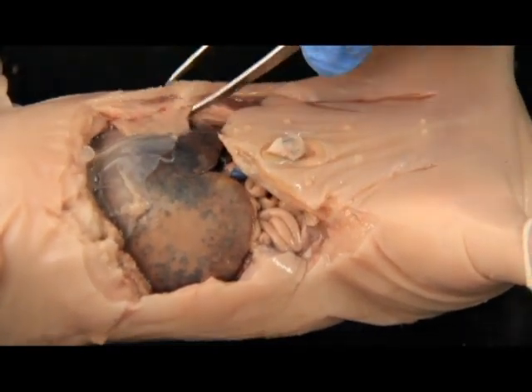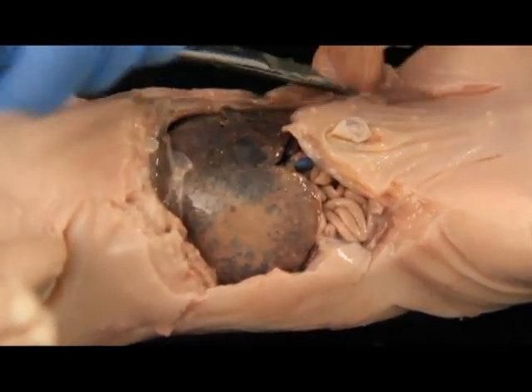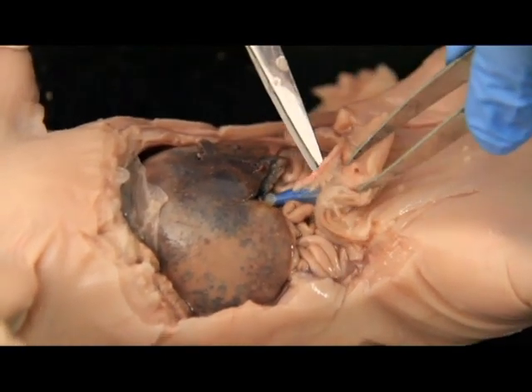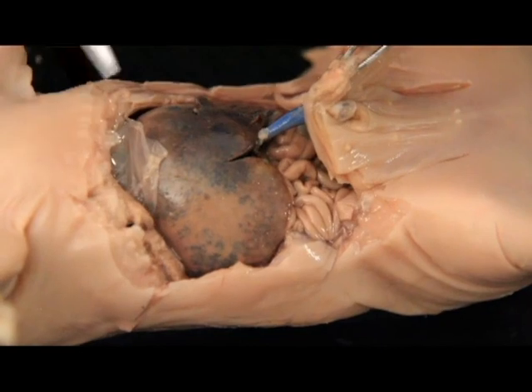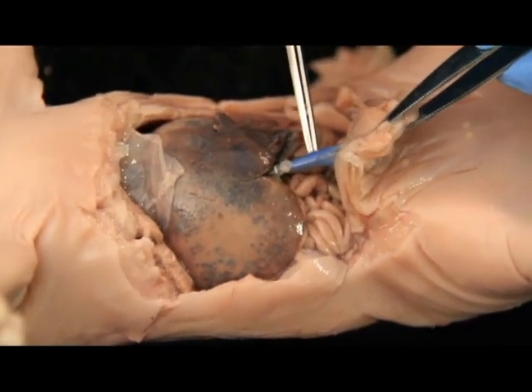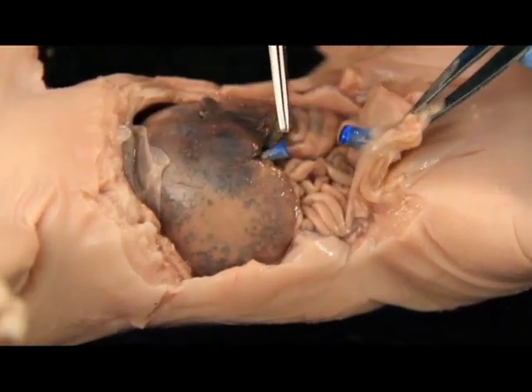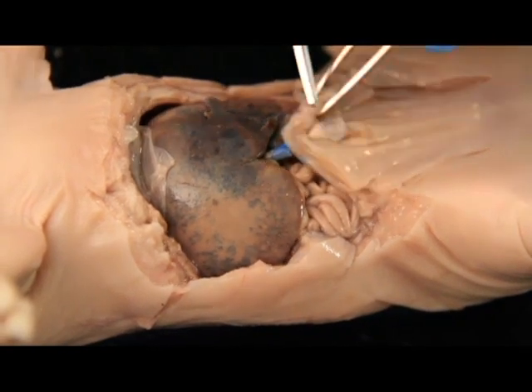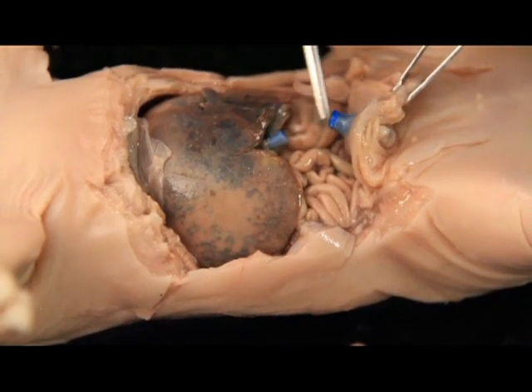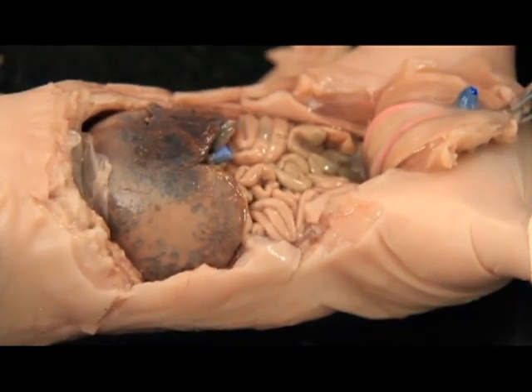Alright, so then we can see our diaphragm, we can cut this excess skin away, and we can start to expose these central organs. Okay, so the first thing you guys should do once you get in this area and you can start seeing everything is you want to cut this little vein right here. Remember, veins are dyed blue, arteries are dyed red. So we want to cut this little vein, but we want to cut it so that we can see it was coming out from under here and going up to our umbilical cord. So this is actually our umbilical vein. So we know it was attached here and here, but now we can flap this down and we can really start to see some more of our organs.